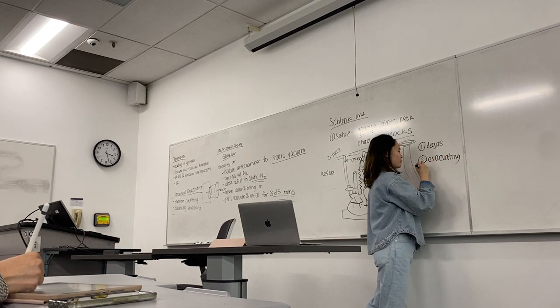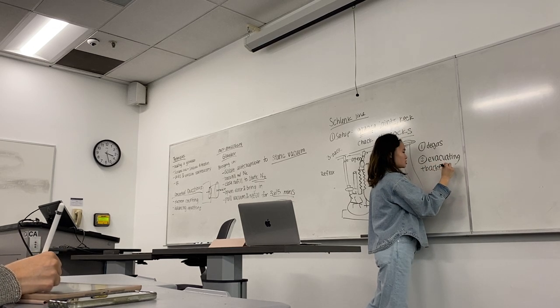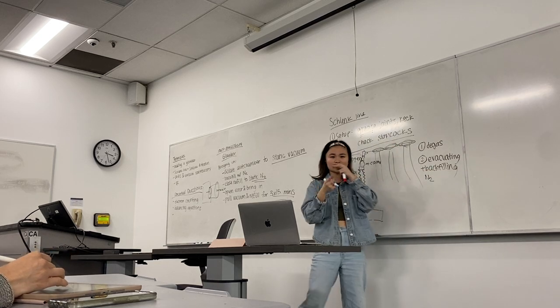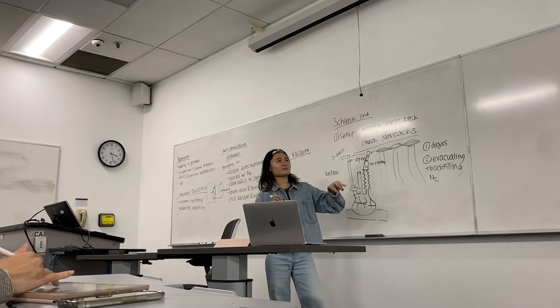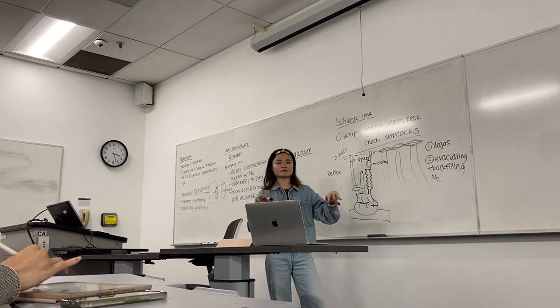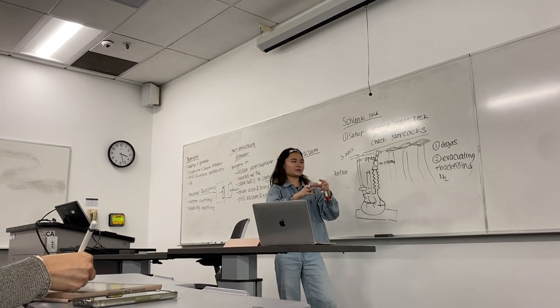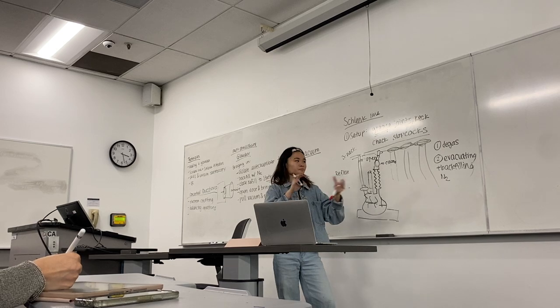Same idea as the glove box, where you want to remove the air, pressurize with nitrogen, and do that 3 times. So in the case of MMT, I believe you degas a bunch of different solutions, then put them together, then evacuate and backfill with nitrogen, and then do the Schlenk filtration.